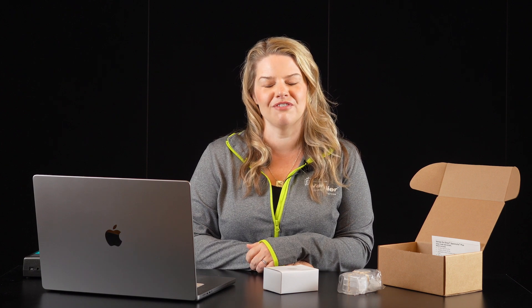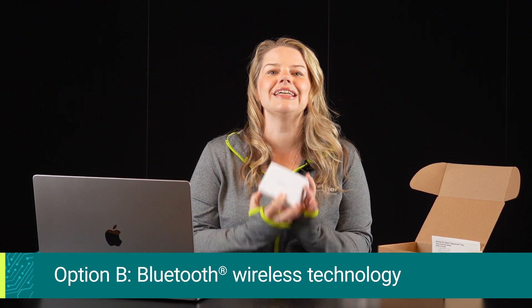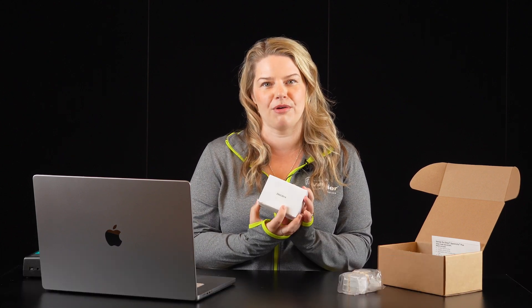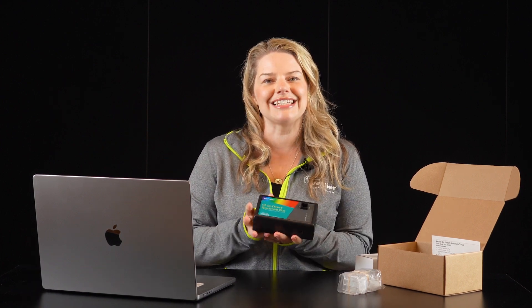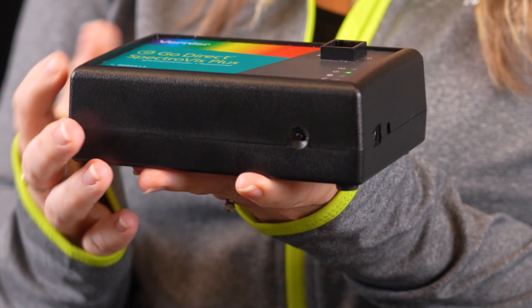The second option is to connect your spectrometer via Bluetooth wireless technology. To do this, you'll need to charge your spectrometer at least eight hours with the included power supply. I've charged this one in advance and made sure to disconnect the power supply before collecting data, as it is recommended that you do not have the power supply attached while collecting data wirelessly.